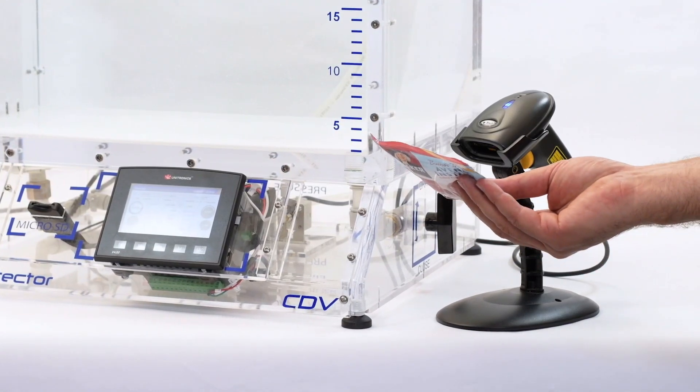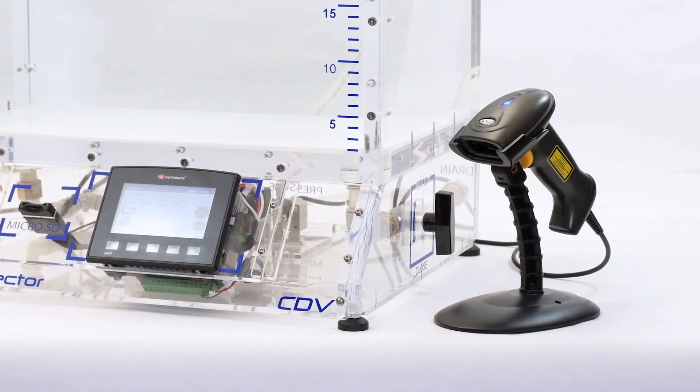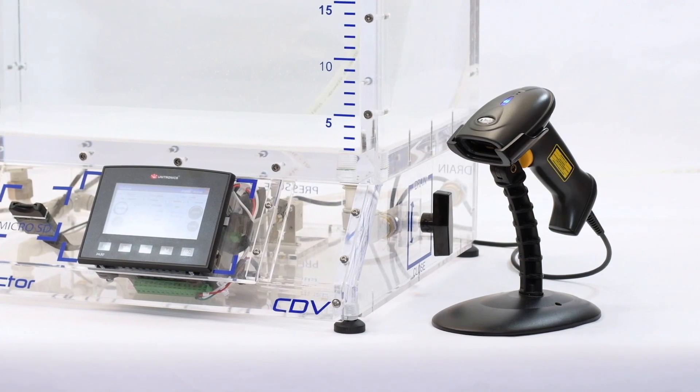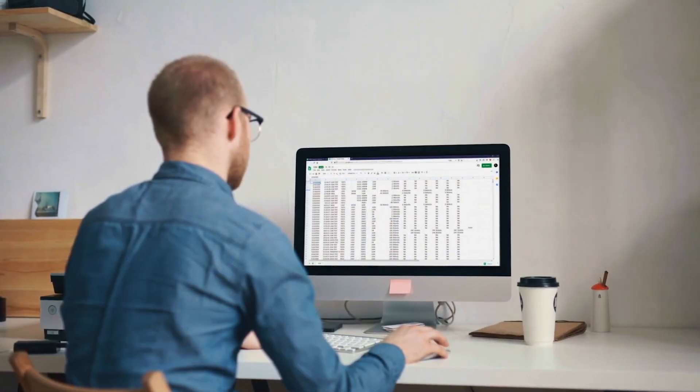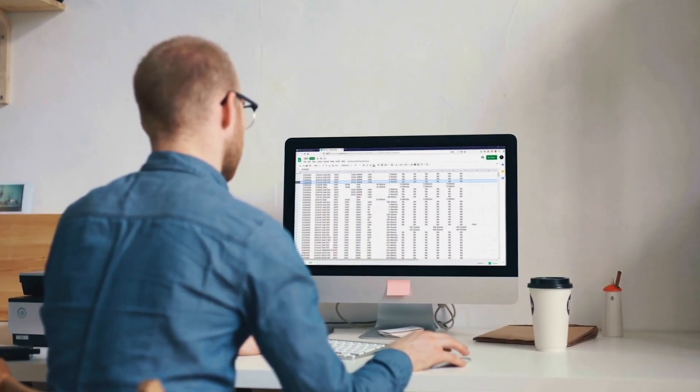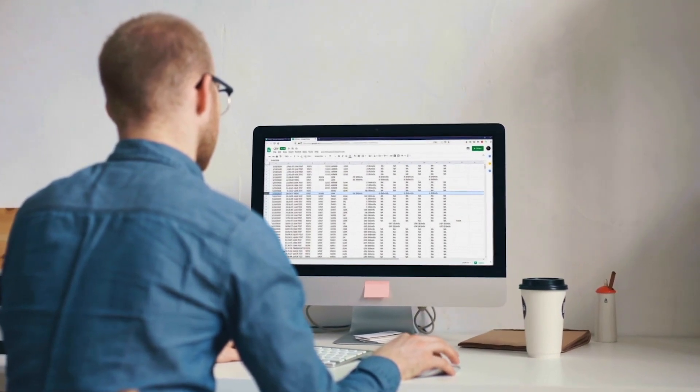You can automate the selection of the recipe using a barcode scanner. At the end of each test, Orion will store the results in a spreadsheet and file them directly into the SD card.